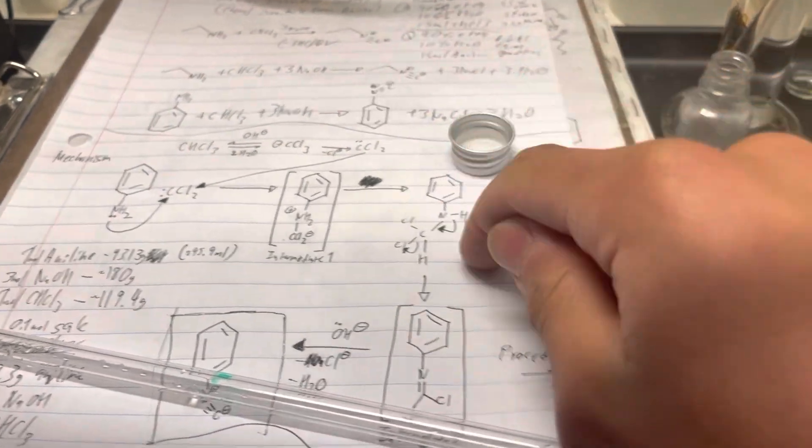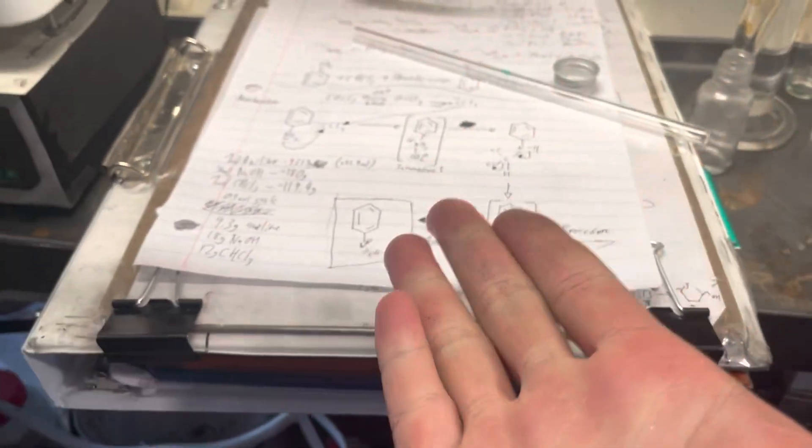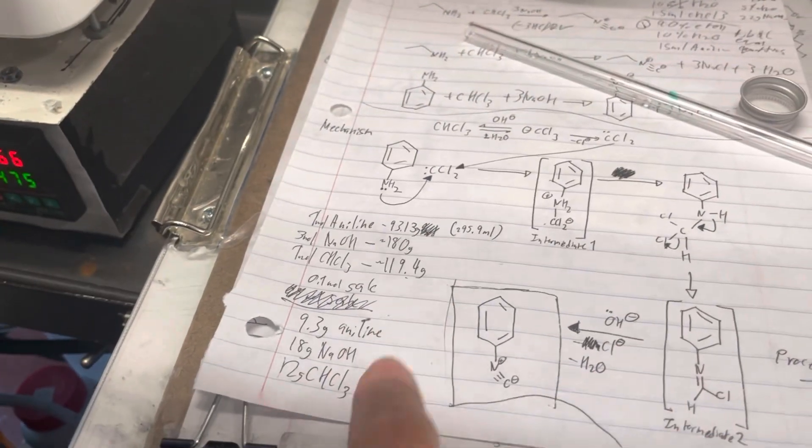So this is sort of an old video that I'm editing up right now because I've got nothing else to do. In this video we're gonna synthesize some phenyl isonitrile. Why? It smells bad.